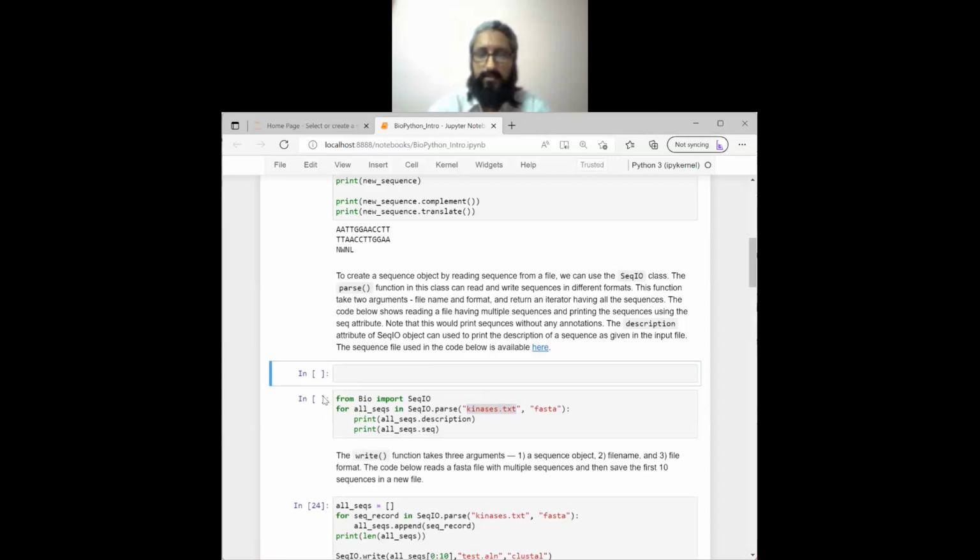Now the next point is, where do you save this file? Excuse me, sir. Yes. Is there a question? Yes, I just wanted to ask, what is the syntax used to find the complementary strand sequence?